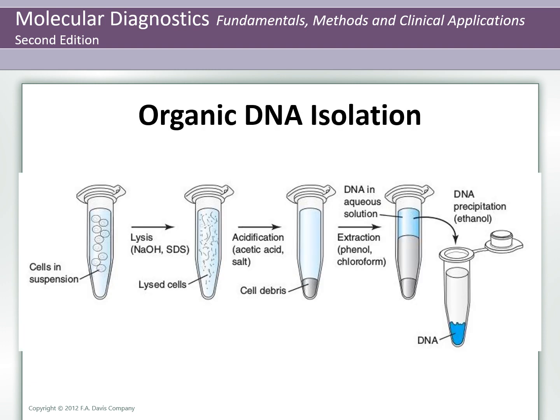This figure is a general schematic of DNA isolation by organic methods. Once the sample is prepared, DNA isolation is performed in several steps. First, lysis, in which the cells and nucleus from the prepared specimen are broken open to release the DNA using sodium hydroxide and sodium dodecyl sulfate, also known as SDS, a detergent. This all occurs in a microtube or a test tube.